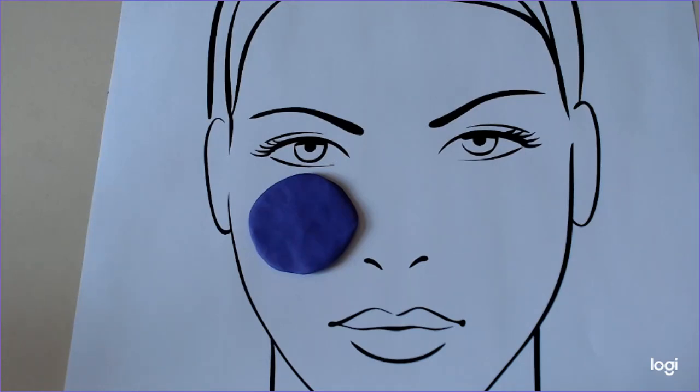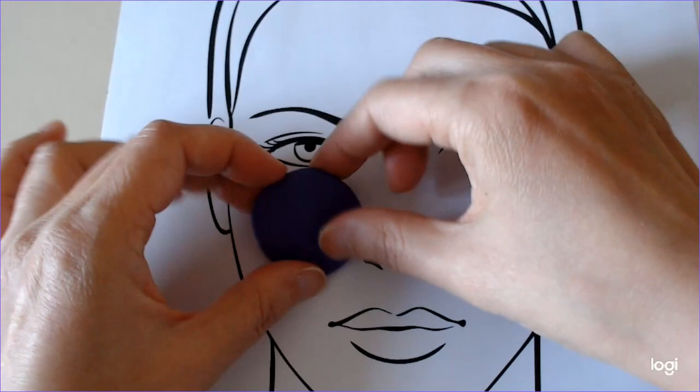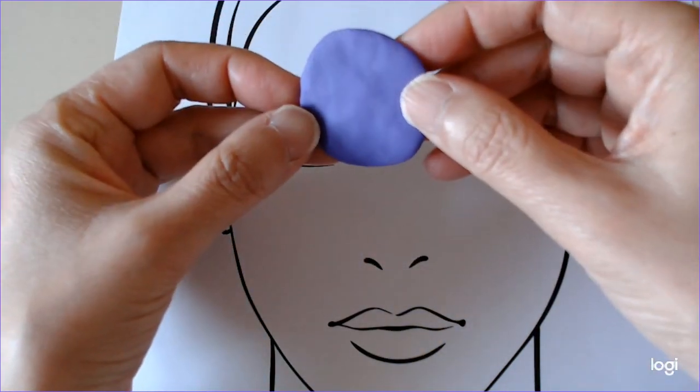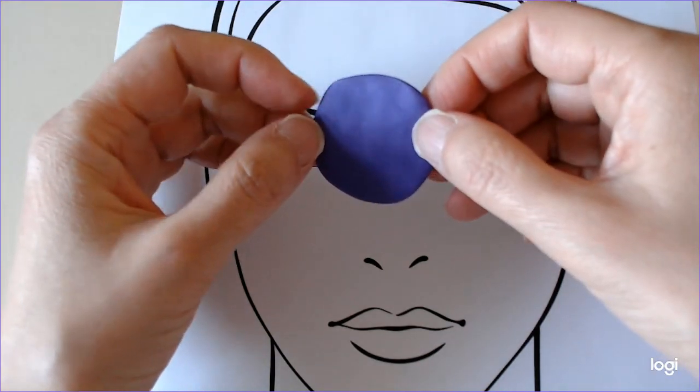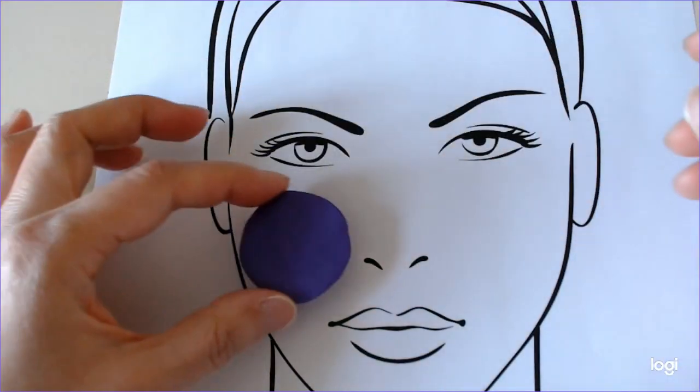I'm going to talk about orientation of skin specimens. If a tumour is incompletely excised, more tissue may be taken at a subsequent operation. When planning re-excision, it's useful for the surgeon to know which margin or margins were involved from the first surgery. When the pathologist receives a piece of skin, they don't know which way round it is relative to the patient. This is where orientation marks come in.